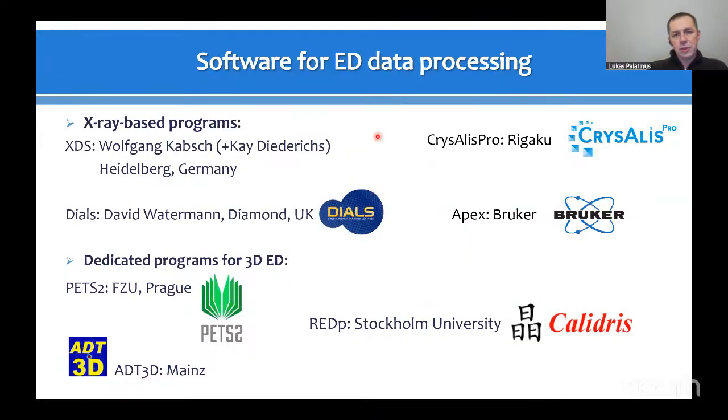When it comes to the software, there is a lot of software available in the field. It can be divided roughly into two main directions. One is X-ray based programs that are adapted to electron diffraction. Among the most widely used are XDS and also DIALS by David Waterman.